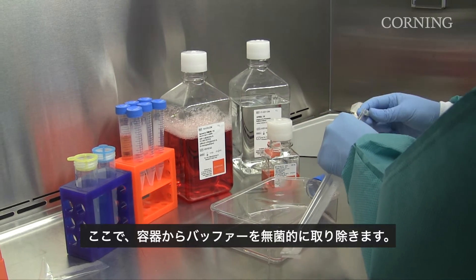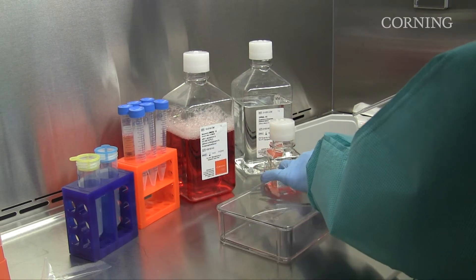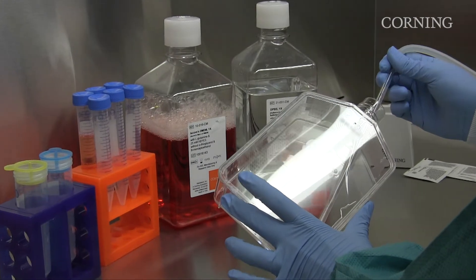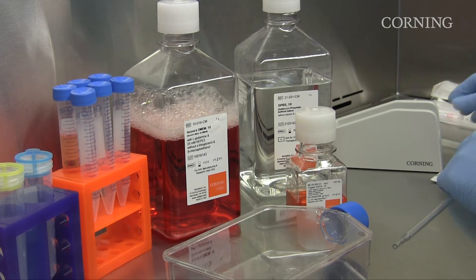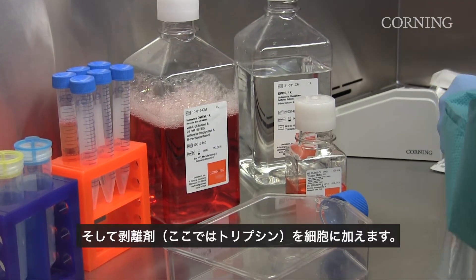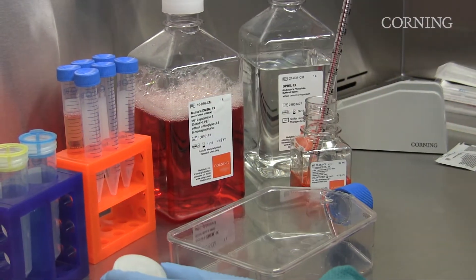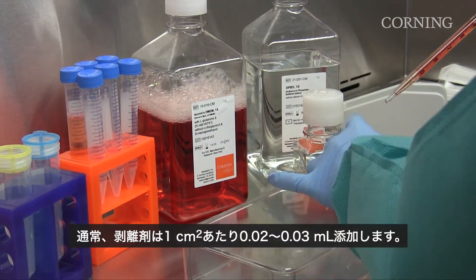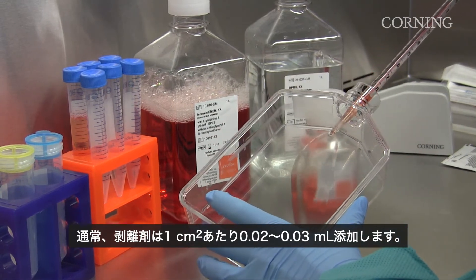Now we will aseptically remove the buffer solution from the vessel and add the dissociation reagent — in this case trypsin — to the cells. Typically, the dissociation reagent is added at 0.02 to 0.03 mls per centimeter squared.